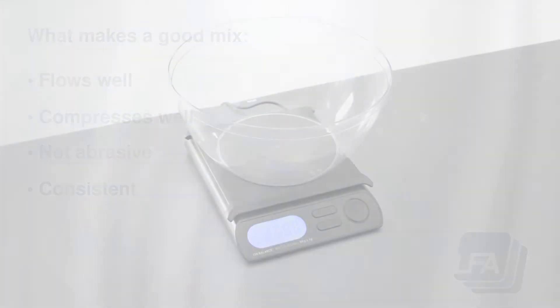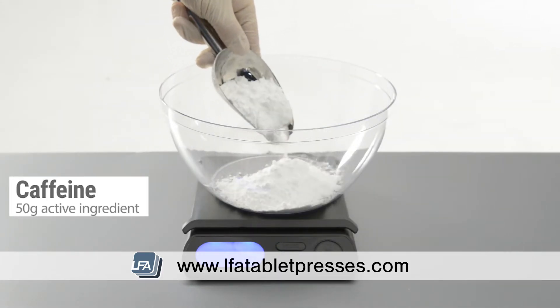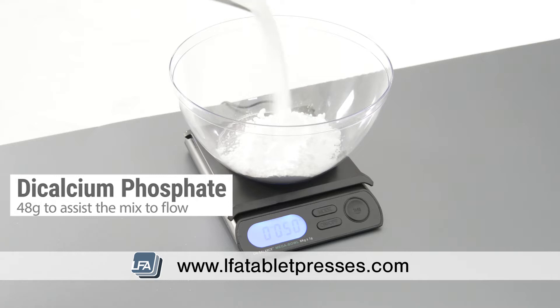Today we're going to be using caffeine powder as our active. We're going to be making a simple 100 gram mix. We always suggest using precise scales where possible to provide accurate weights. First, we're going to add 50 grams of our active ingredient, caffeine powder. Next, we're going to add 48 grams of dicalcium phosphate, which will help it flow.